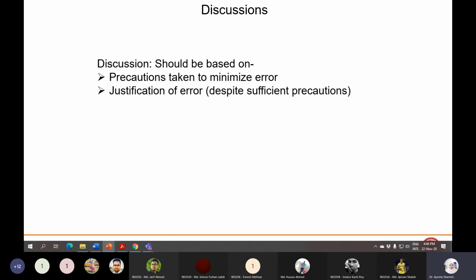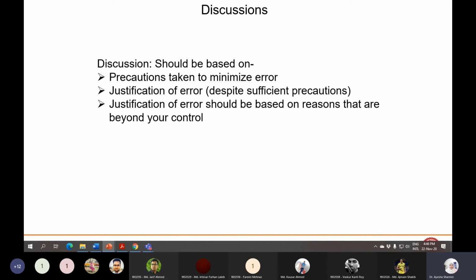And give it time to settle down the precipitate when it has formed, that brown precipitate, before you are adding the sulfuric acid. Okay? And also the sulfuric acid has to be added close to the precipitate, that means down at the bottom. So these are some precautions you should take. And one more thing is these chemicals are toxic and irritant. So be very careful when you are dealing with these chemicals.